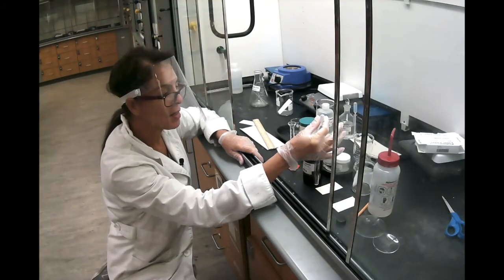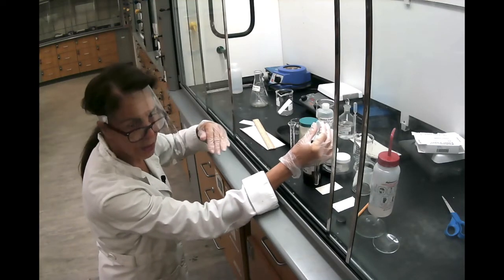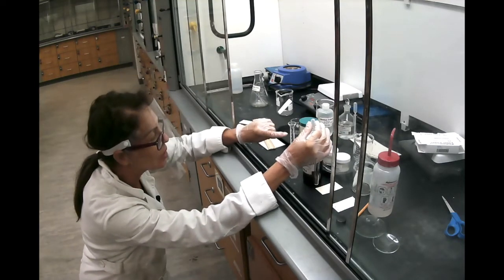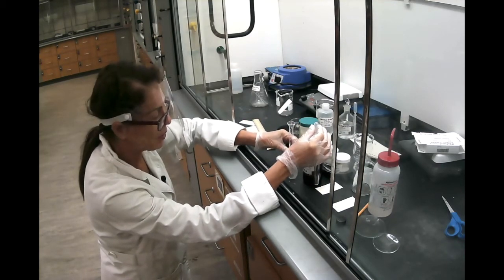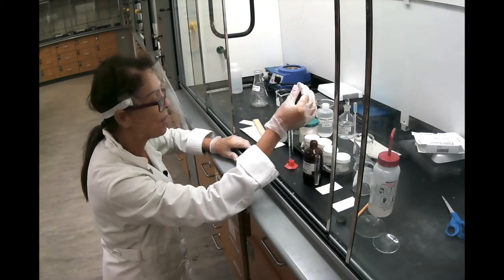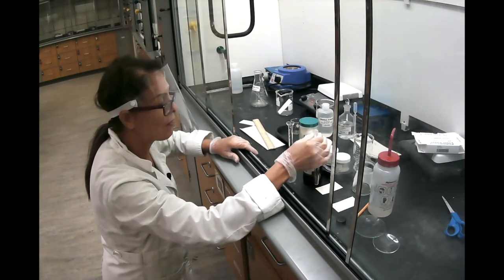So what is the liquid, the mobile phase? As I said, we have ethyl acetate, and you notice that I put my eye level to the level of the graduated cylinder and not the other way around. The graduated cylinder must be on a flat surface, and I'm going to fill it up with 9.5 milliliters of ethyl acetate.